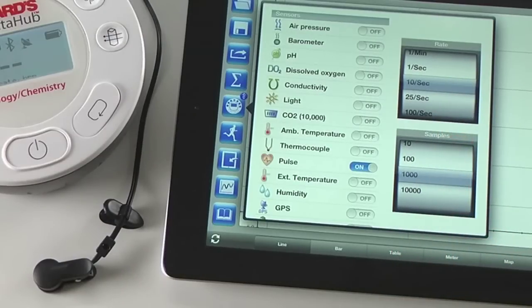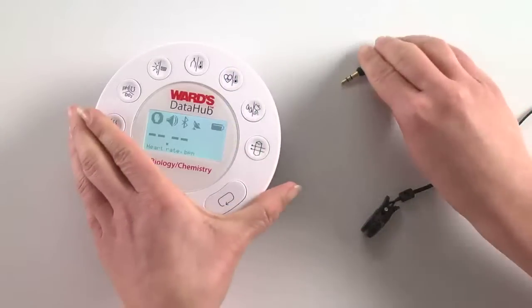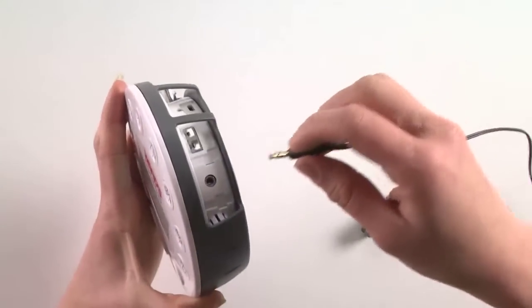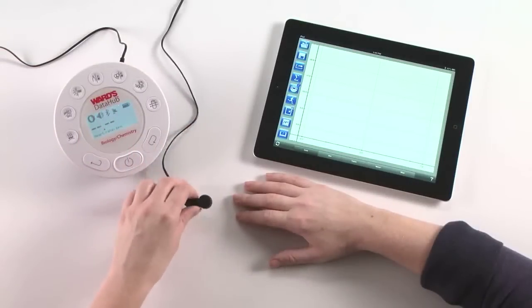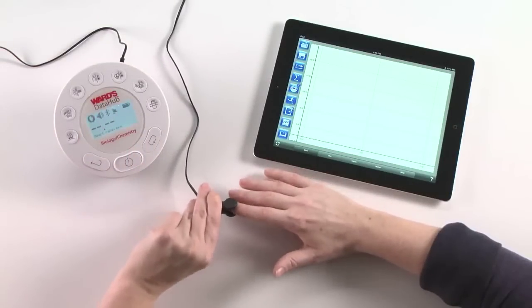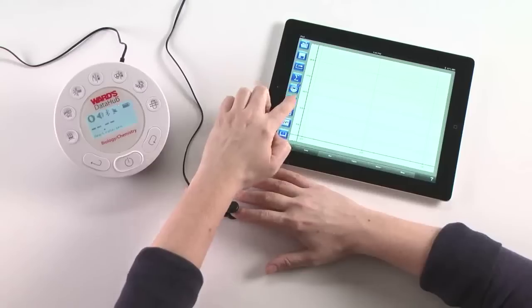With the heart rate sensor inserted into the DataHub and the heart rate clip placed on the student's finger, we're ready to begin recording data wirelessly.